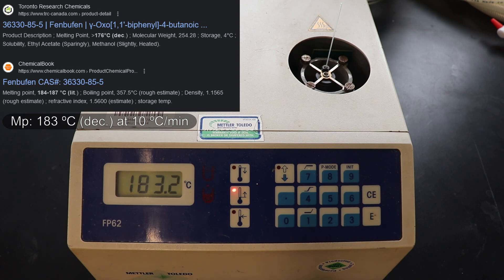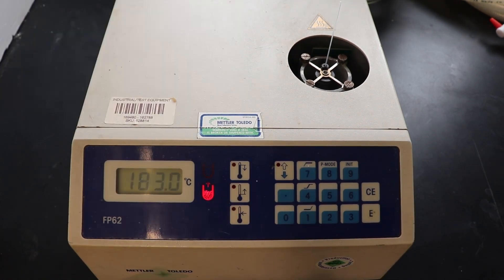However, it also states that decomposition can begin to occur above 176 degrees, so it's hard to get a perfectly fixed number for the melting point due to that. But when I ran the sample, I got a melting point of 183 degrees Celsius at a heating rate of 10 degrees Celsius per minute.